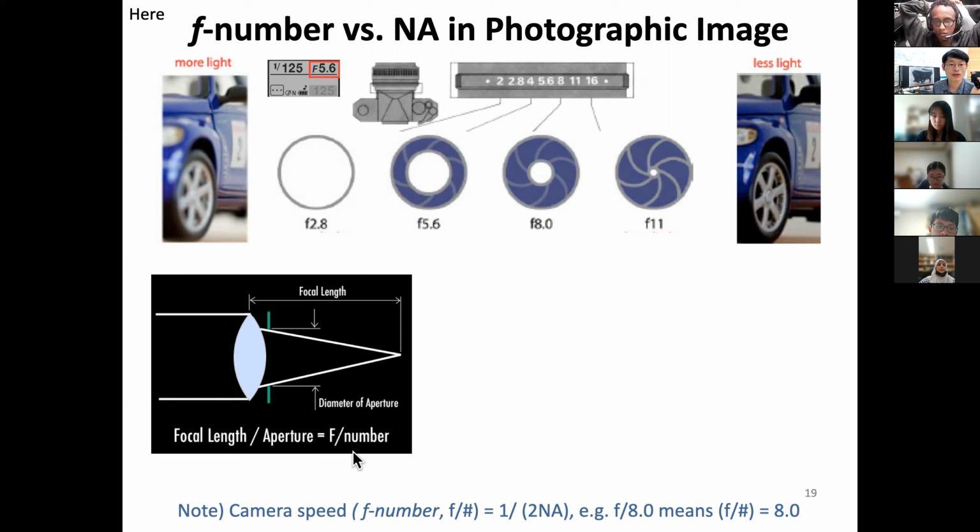One thing that's a little confusing is F/number. You can consider this as just one parameter we call F number. That's why we sometimes put F/ and just a number, the pound notation.